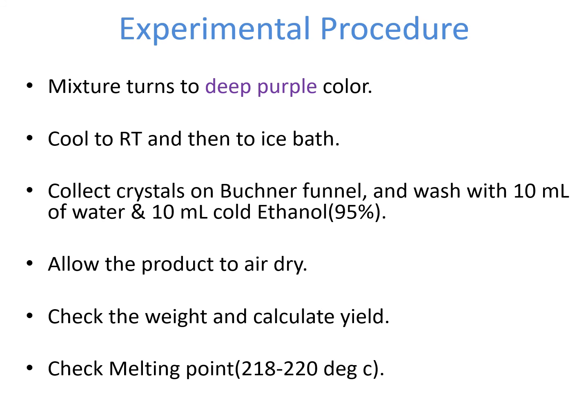It's good to use the same amount of water and ethanol mixture here to wash the product, and then once we have the crystals we can allow them to air dry. It will take some time, and either we have to let it stay overnight, or we have to wait for a couple of hours for it to dry.